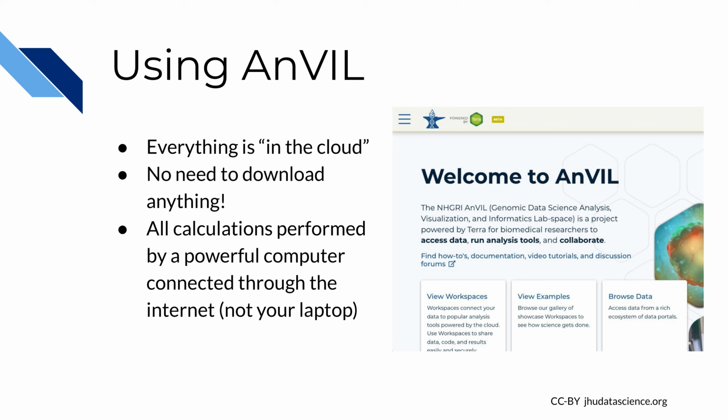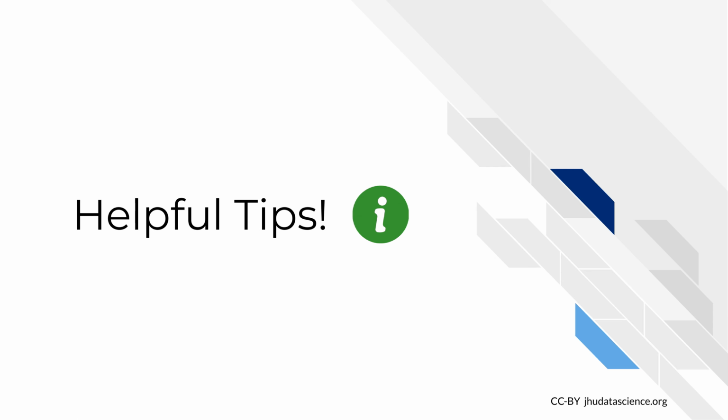We will be using AnVIL as the platform to do our analyses. Everything is in the cloud, so there is no need to download anything. All calculations are performed by a powerful computer connected through the internet and don't need to happen on your computer. We will go over how to log into AnVIL in a moment, but first there are a few things that are important to pay attention to during this exercise.